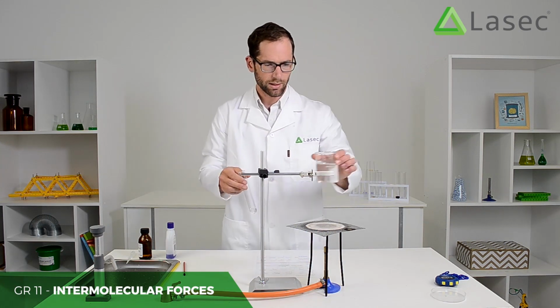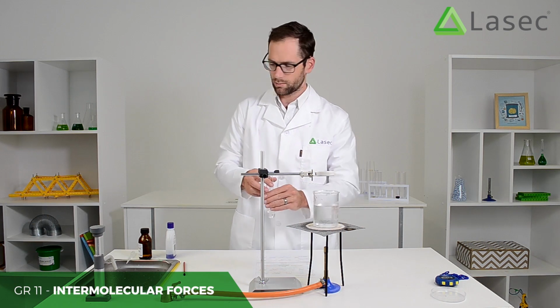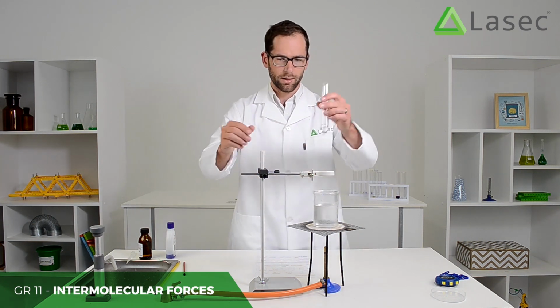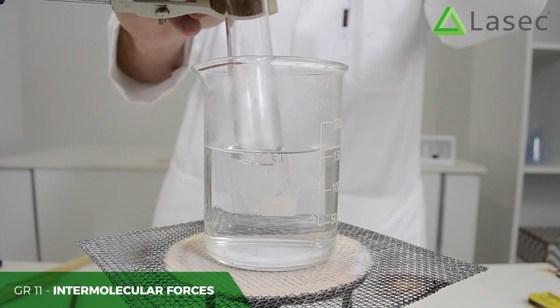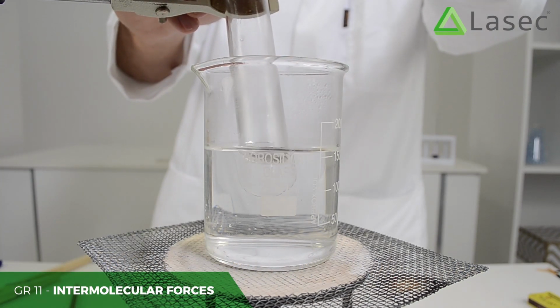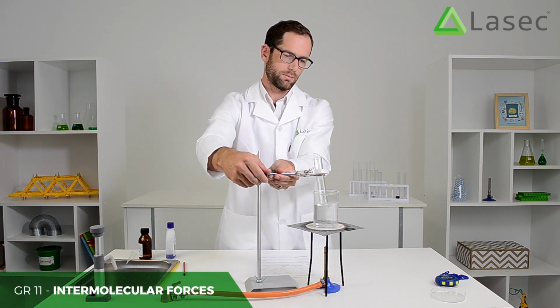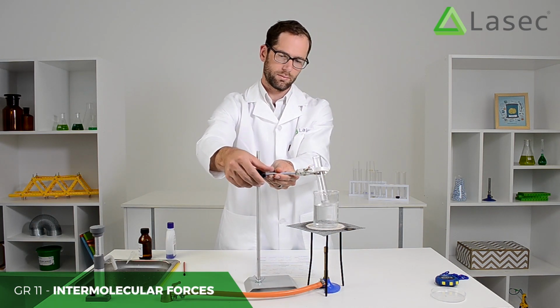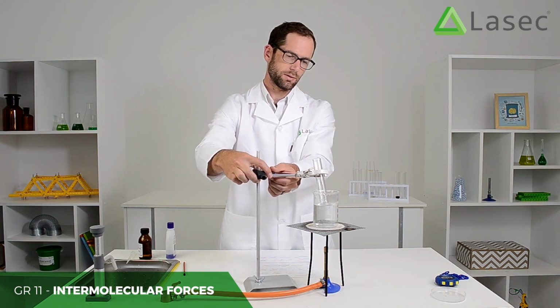So what I'm going to do is put a beaker of water over here, and then get my ethanol in the water, and using the heat from the water, I'm going to heat up this ethanol in the test tube.